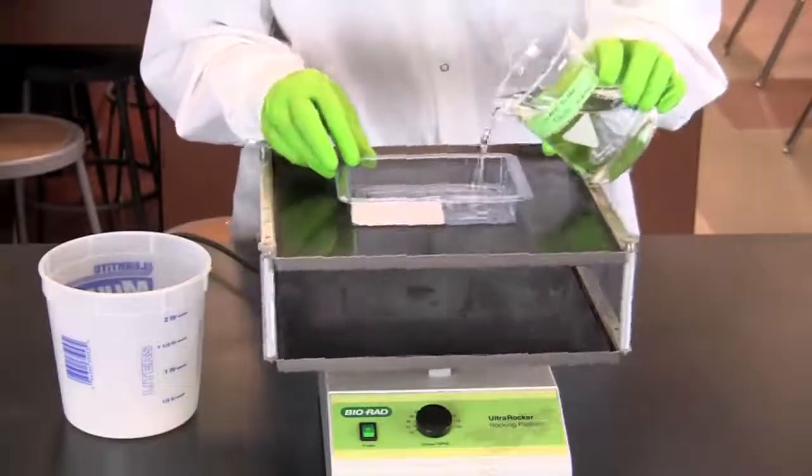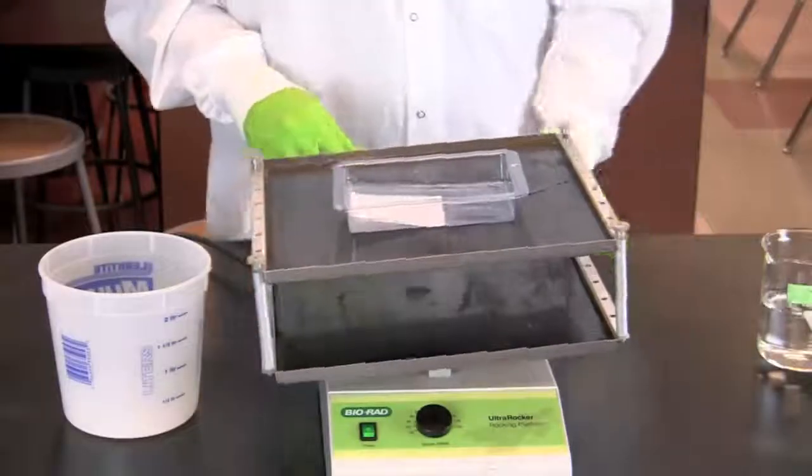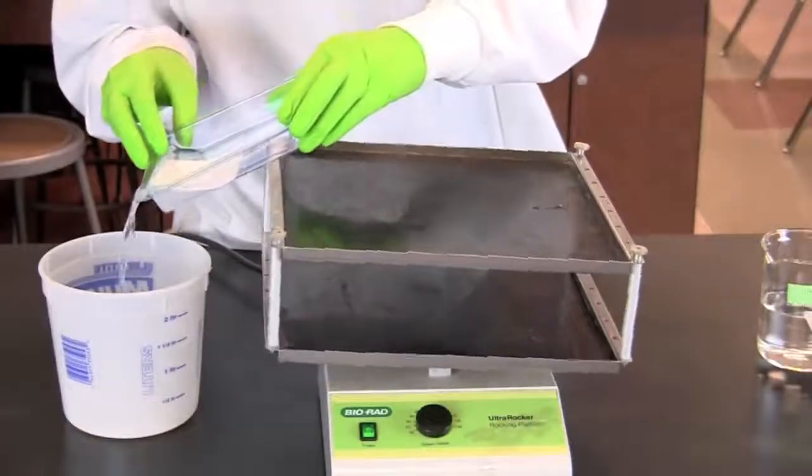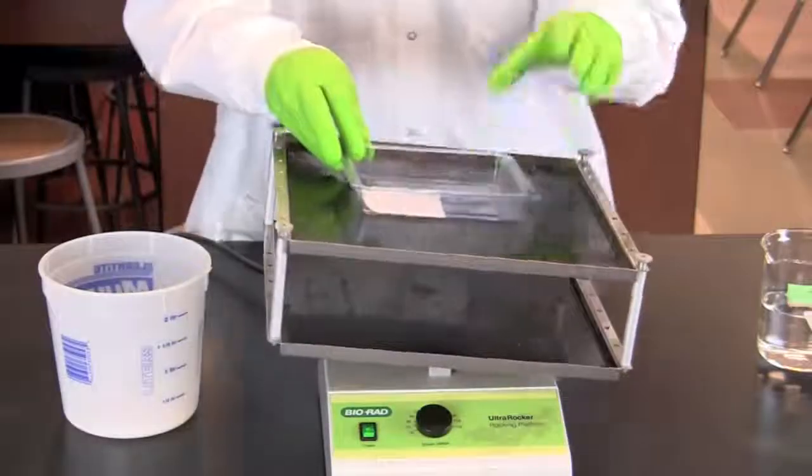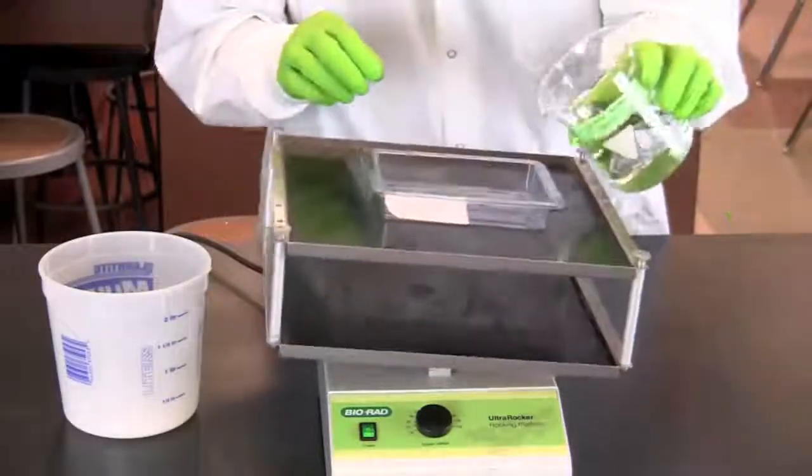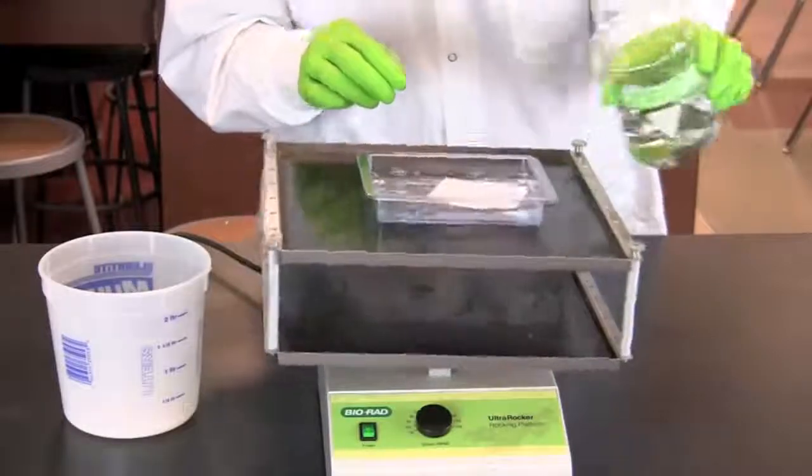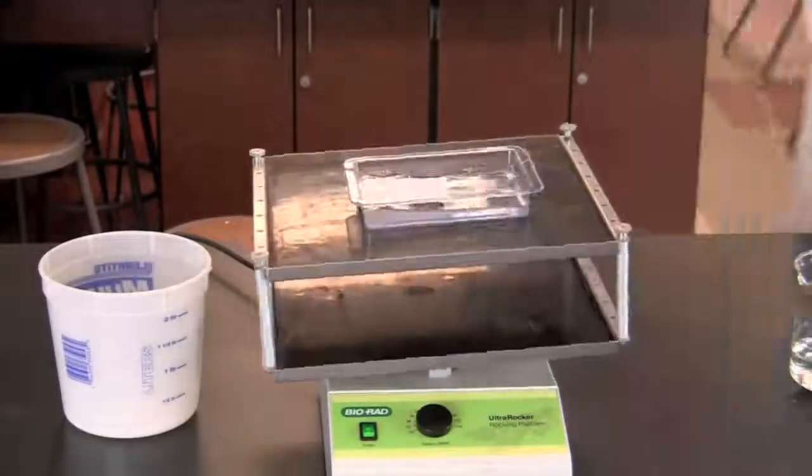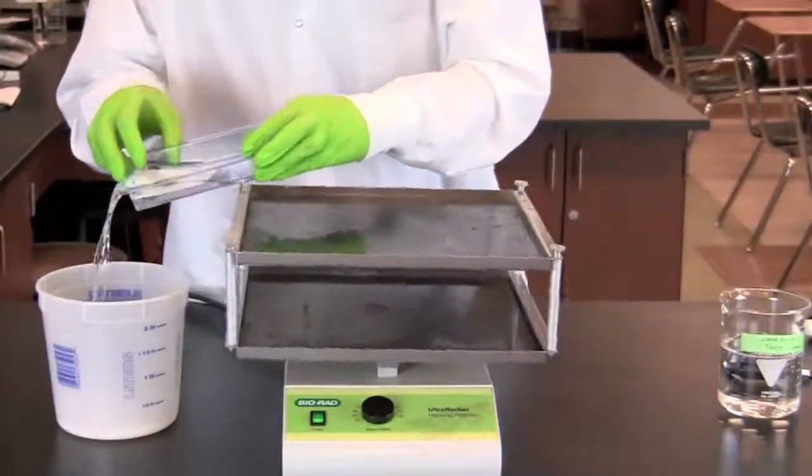Rinse the membrane quickly in 50 milliliters of wash buffer and then discard the wash buffer. Add another 50 milliliters of wash buffer to the membrane and let it wash for three minutes on the rocking platform at a medium speed setting. Discard the wash buffer.